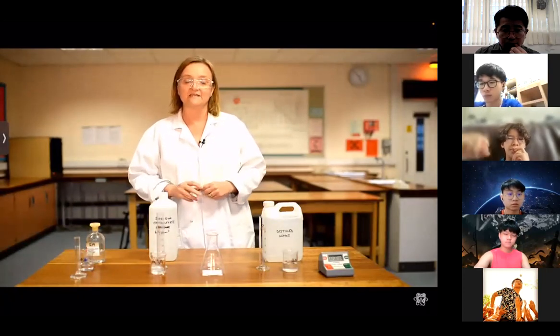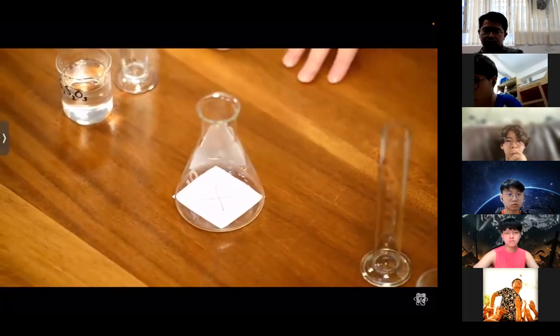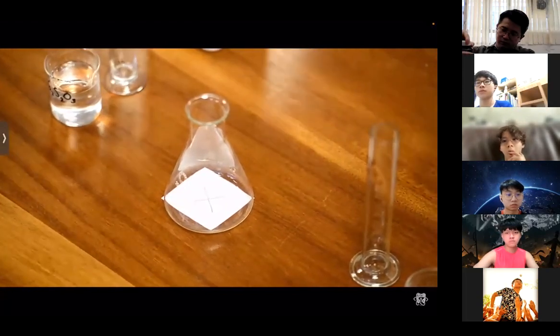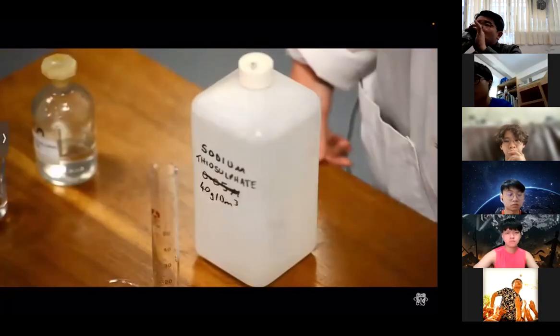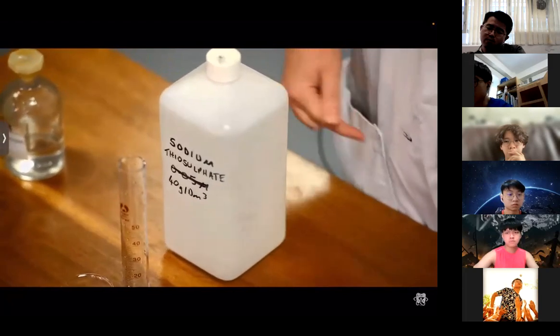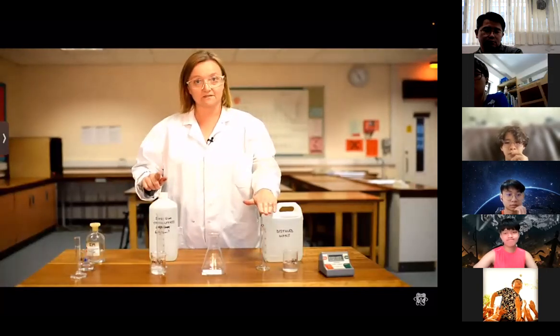We're going to time how long it takes for that cloudy yellow colour to get so thick that we can't observe a cross that I have drawn on a piece of paper with a pencil. That cross is going to go underneath the reaction vessel, and we're going to simply mix together 50 centimetres cubed of sodium thiosulfate with 10 of hydrochloric acid. We're going to vary the concentration of the sodium thiosulfate and see what effect that has on the time it takes for the precipitate to form and for the cross to disappear from view. We'll be changing that concentration by diluting our sodium thiosulfate with some distilled water.